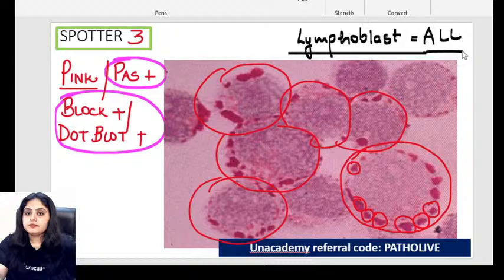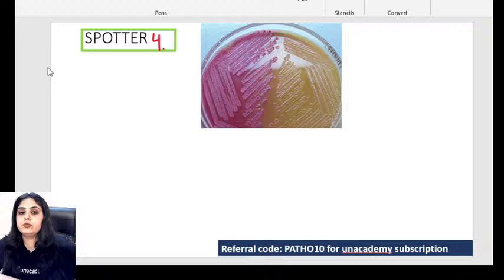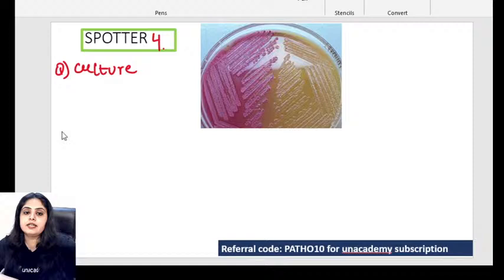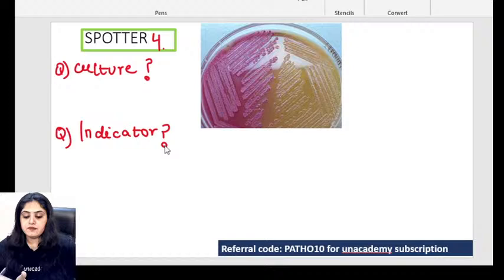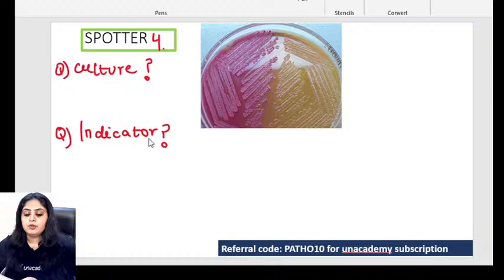Moving to spotter number four — two questions: name of the culture media shown, and the indicator used in this culture media. Some say MacConkey, some say CLED — both are lactose-based, so that's not resolving it. Tell me the specific name and the indicator.